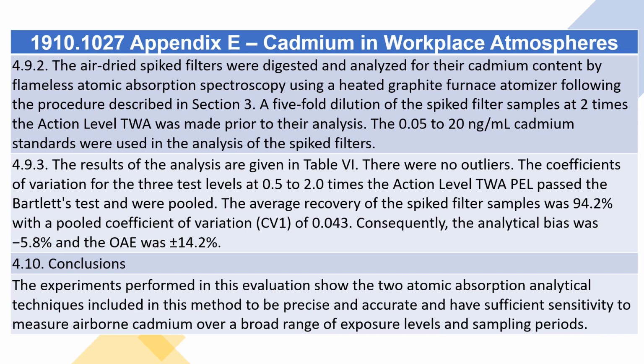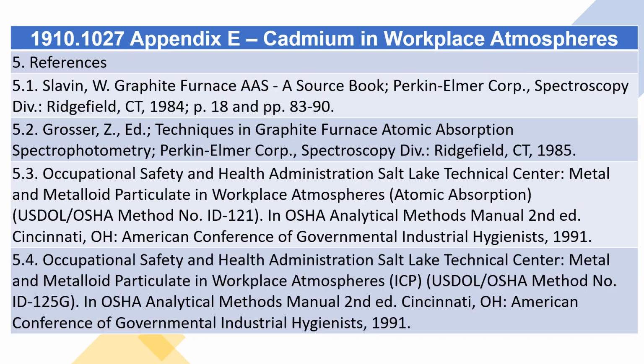4.10 Conclusions. The experiments performed in this evaluation show the two atomic absorption analytical techniques included in this method to be precise and accurate and have sufficient sensitivity to measure airborne cadmium over a broad range of exposure levels and sampling periods. 5. References. 5.1.